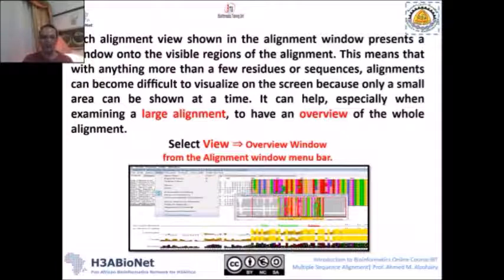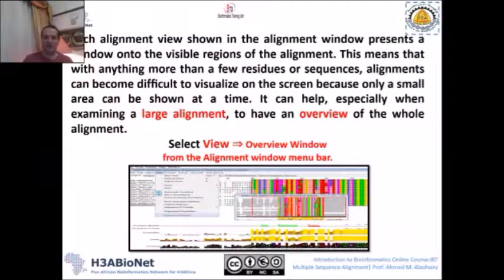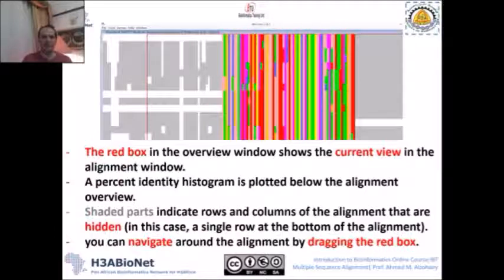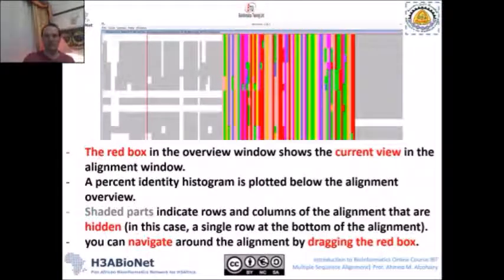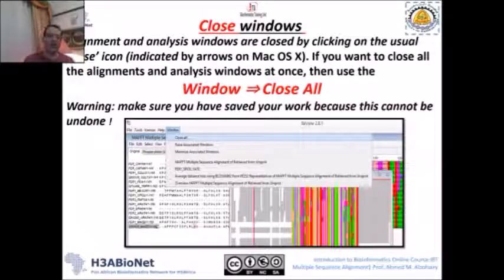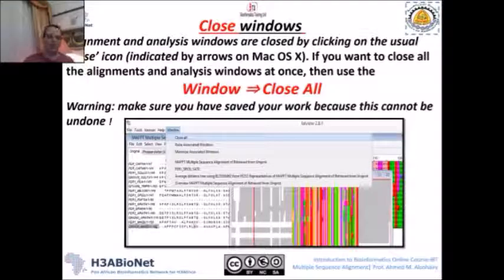The Overview Window can be opened from the View menu by choosing Overview Window. This window allows you to see your large alignment and move within it to find important parts. The most conserved regions appear more colorful, while less conserved regions appear more shaded in gray — so you can identify which parts of your alignment to focus on. If you have many windows open and want to close them all at once, go to the Window menu and choose Close All.